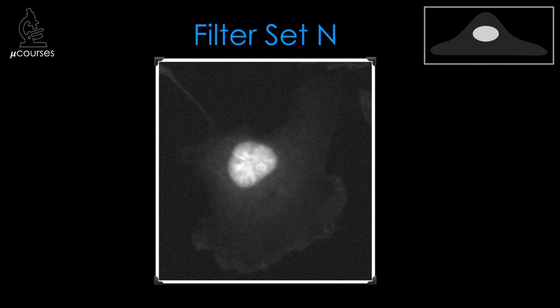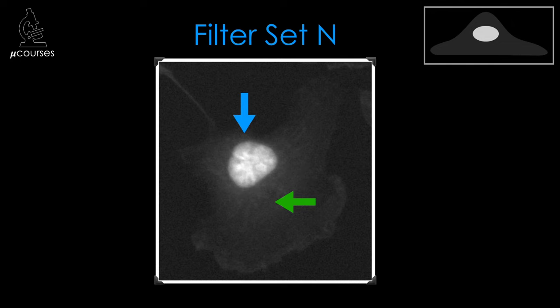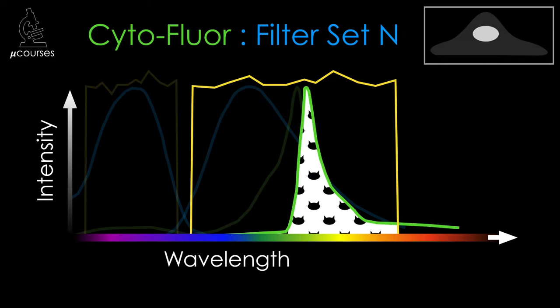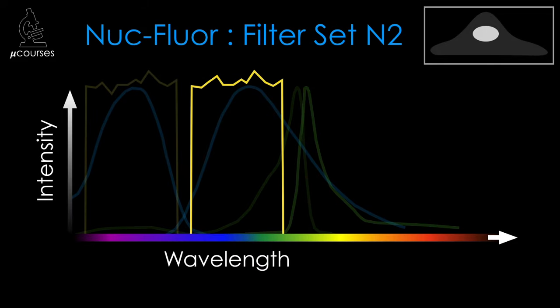And sure enough, if we collect an image of our specimen using filter set N, we see signal in the nucleus as expected from nukeflor, but we also see signal in the cytoplasm where cytoflor localizes. If we collected an image with filter set N and assumed all signal came from nukeflor, we would incorrectly conclude that nukeflor localizes to the cytoplasm as well as the nucleus.